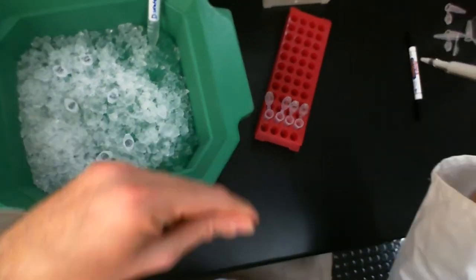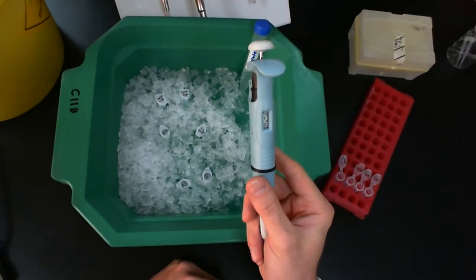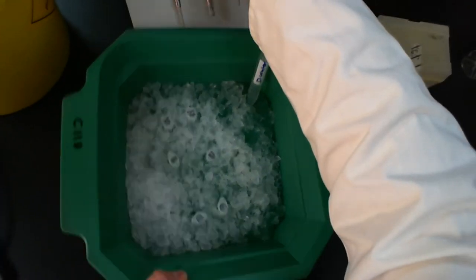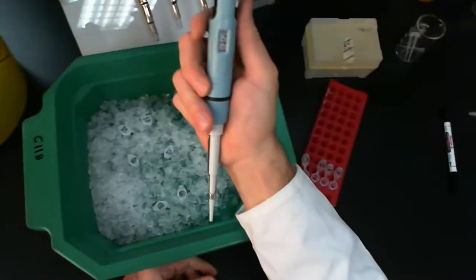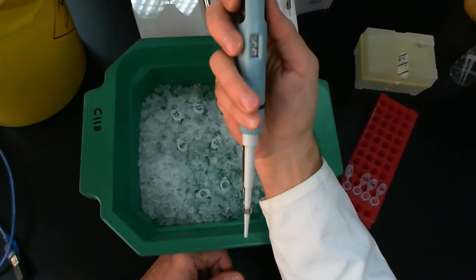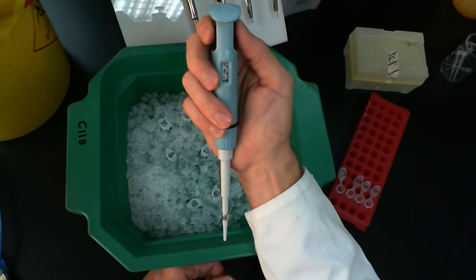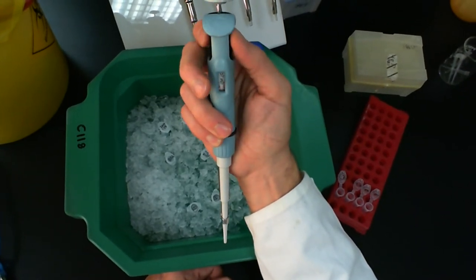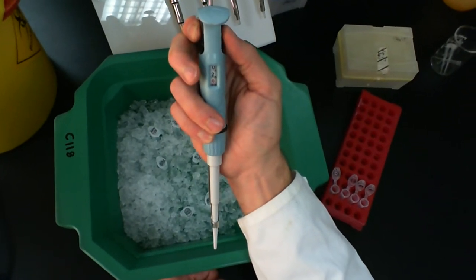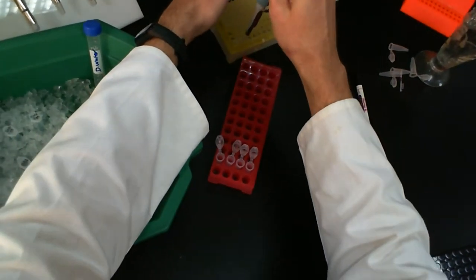Now the next thing we're going to add is the buffer. I need 2 microliters of that, so I'm not going to use this micropipette. I'm going to get a P20, which is this one here. P20 is currently set to 050, that's 5 microliters. I'm going to change that to 020, and that's going to be 2 microliters. The reason we're using 2 microliters is not some random number. This is a 10x buffer, so that means it's 10 times more concentrated than it needs to be.